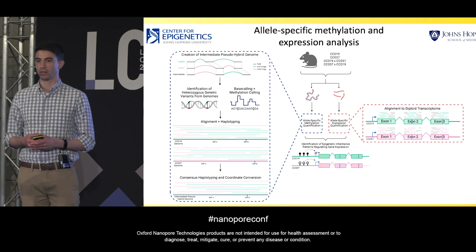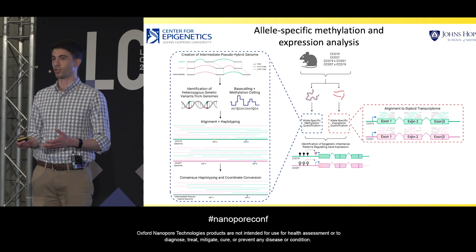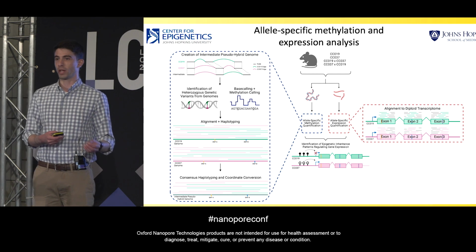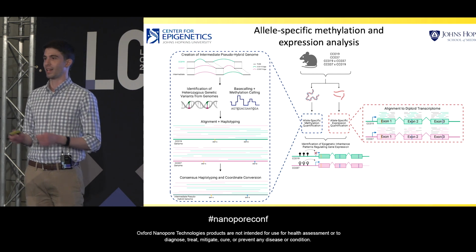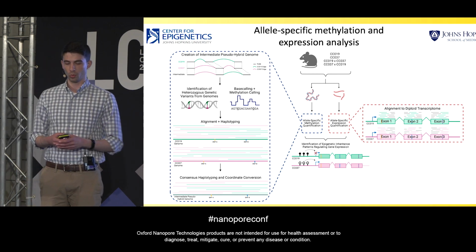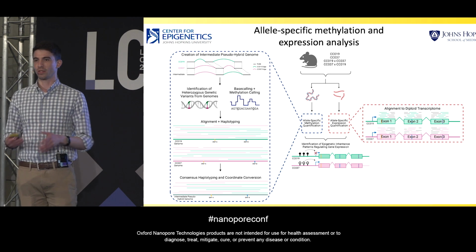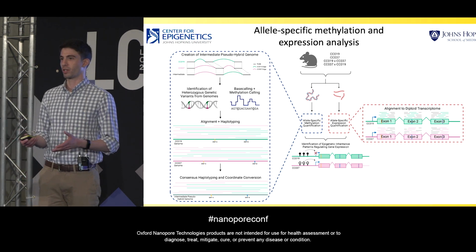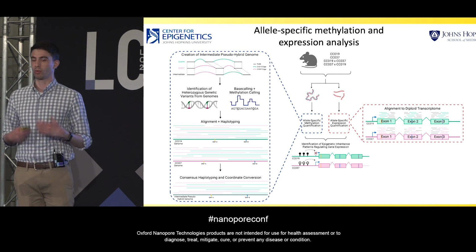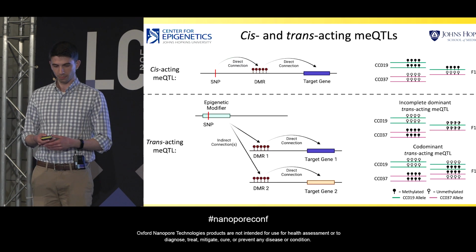allele-specific methylation comparisons. As such, our pipeline performs alignment and phasing relative to both reference genomes and extracts only those consensus phasing decisions. So effectively, those reads where allelic assignment is consistent, independent of the choice of reference genome. Furthermore, we've designed a novel tool which creates what we are calling an intermediate pseudo-hybrid genome, which is effectively a single unified coordinate system that represents all of the genetic diversity of our two reference genomes. And we perform all of our methylation comparisons within that unified coordinate system.